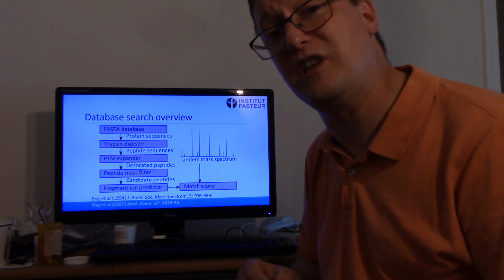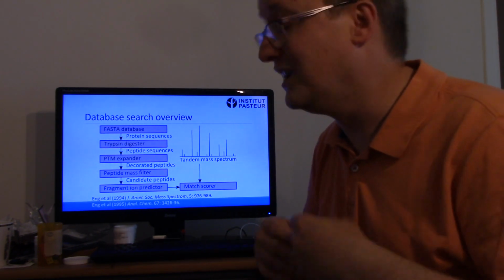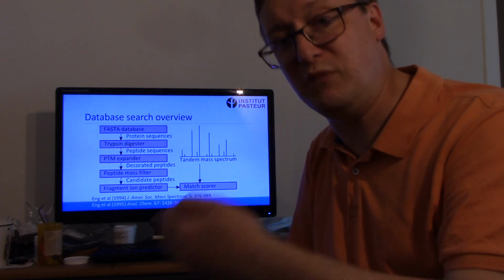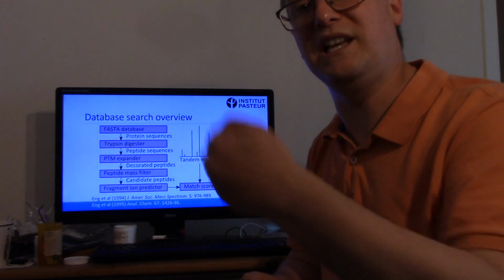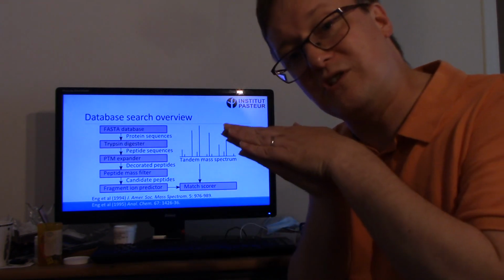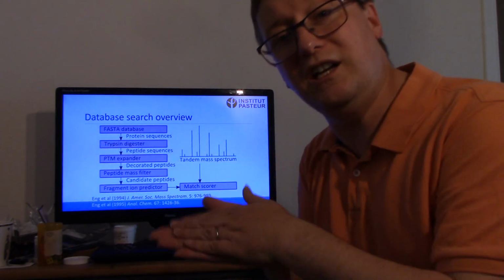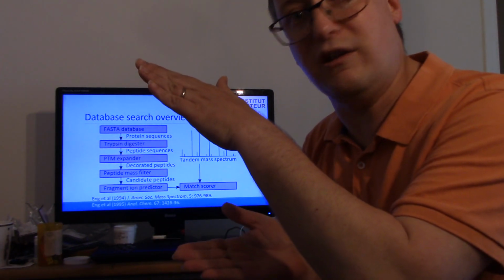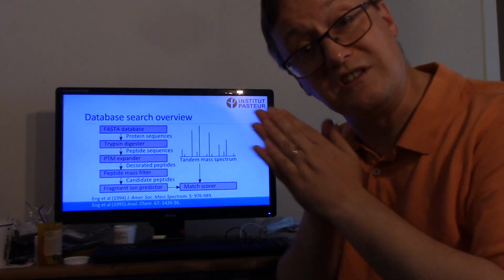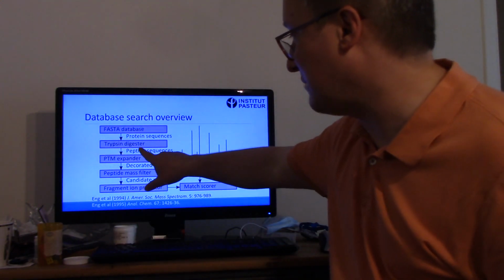And one of the things that methionine does, if exposed to oxygen, is to oxidize. So instead of having the normal mass of methionine, we have methionine plus 16 to reflect the gain of oxygen. So every time the software sees this methionine, it has to go this way, meaning not modified, or that way, representing modified. It causes a branch, essentially, in those peptide sequences.